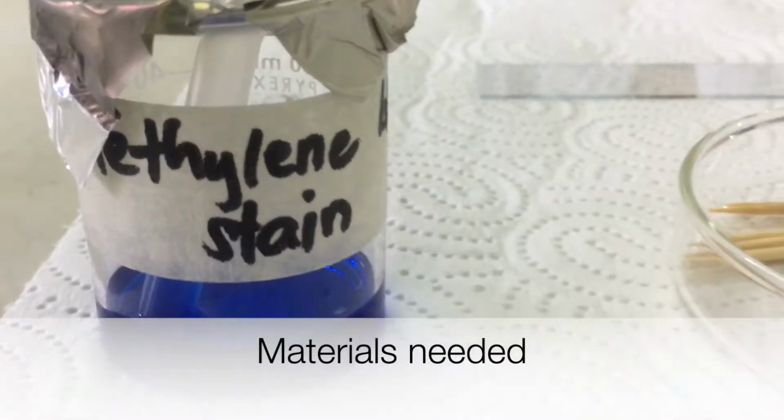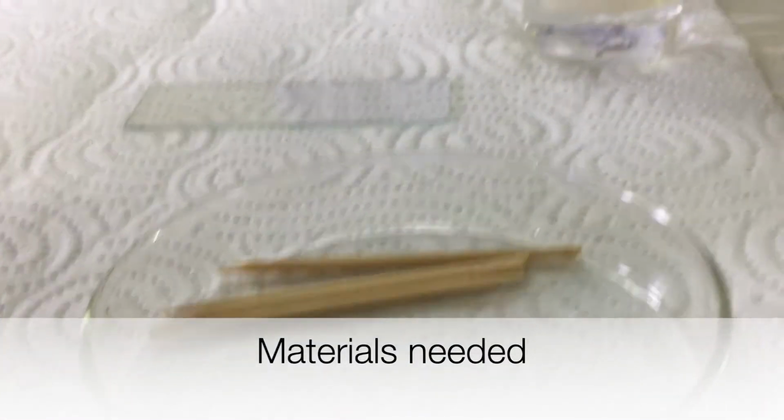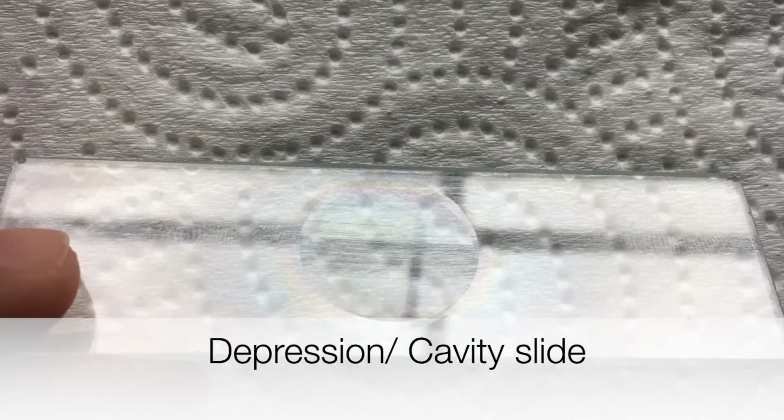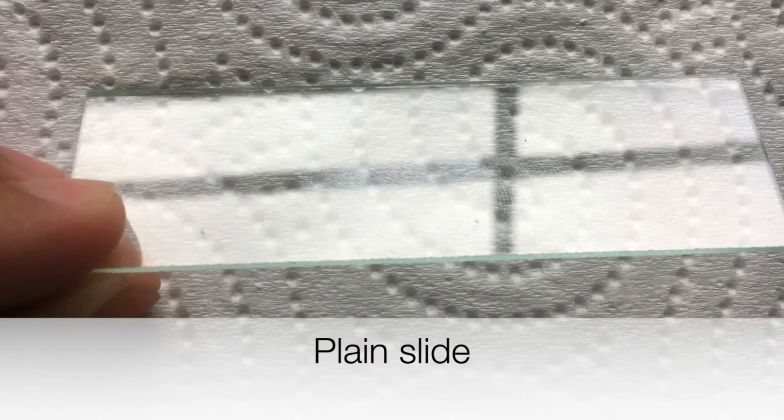In this video, you will observe cheek cells. Cheek cells are eukaryotic cells that are easily shed from the mouth lining. It's therefore easy to obtain them for observation.